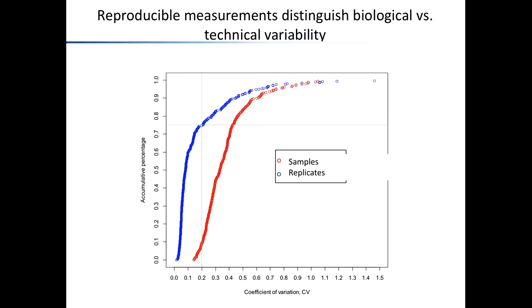So this is coming back to a point I made on Monday with the simulations that Ting, the student from Olga Witek's laboratory, generated. I don't know whether you may remember this, where I said that it is more important to have protein measurements on fewer proteins that are precisely measured than a very large number of proteins that are noisy, if we want to make such associations. And this is exactly the same issue again. If we had this blue curve out here, basically overlapping with the red curve, it would mean we have so much technical variation, because the molecular measurements are so noisy, that we would never see a biological effect.